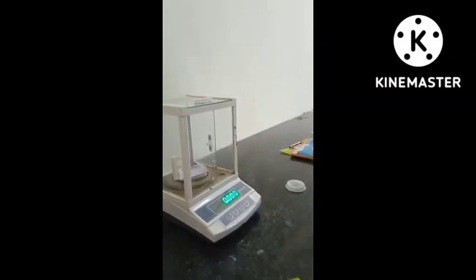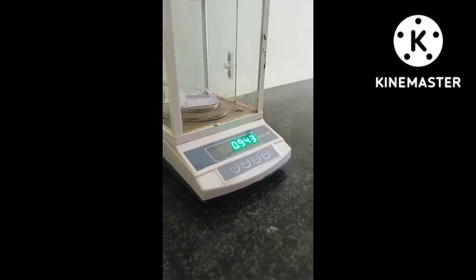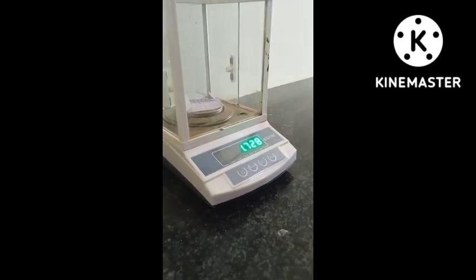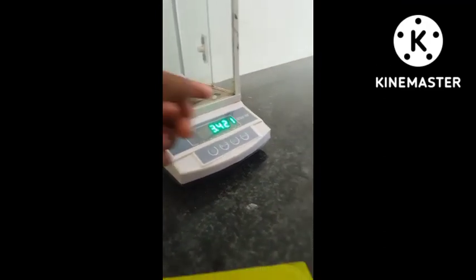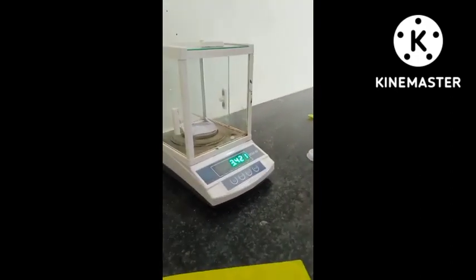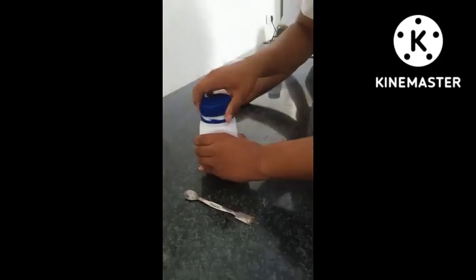So this is sodium hydroxide, we are measuring it, that is 4 grams. This is in a solid form and kept in a bottle or one box. This is one of the very important compounds we can say, which is used in chemical labs also.